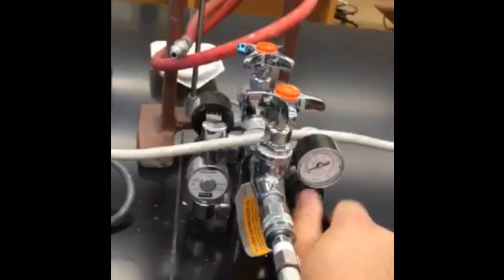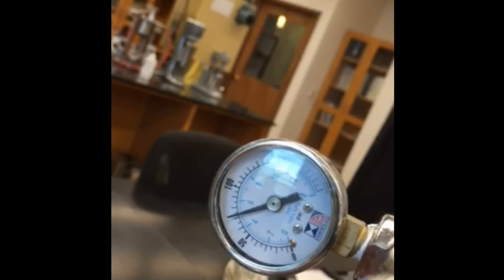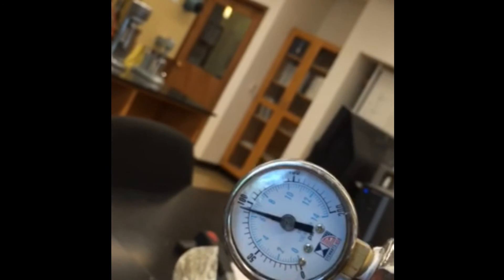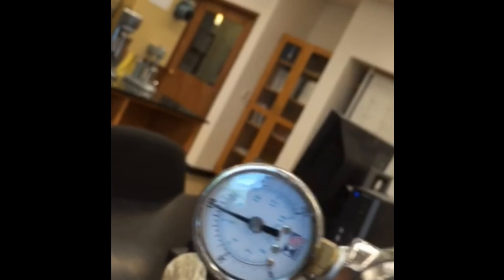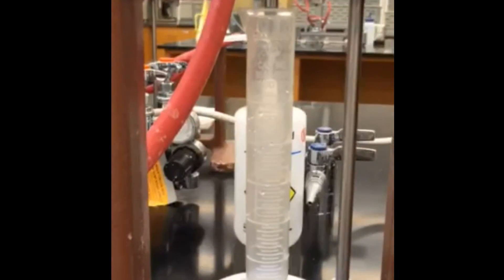We measure the water and determine how good that filter cake is at plugging holes. One of the big things with bentonite is you want proper viscosity, and you also want it to plug holes. That's one of the main things bentonite does — it's excellent for plugging holes. And with this filter press test, we can test exactly that.